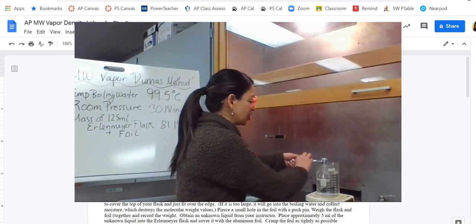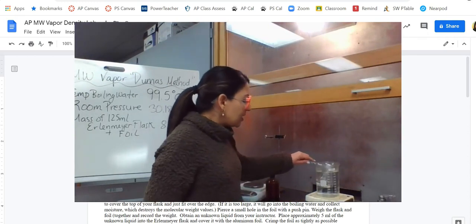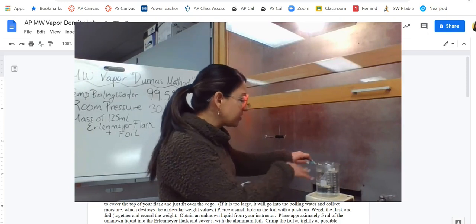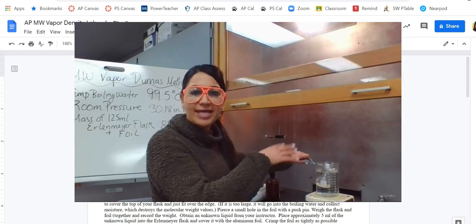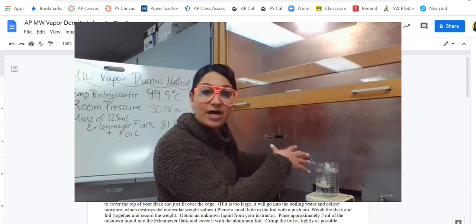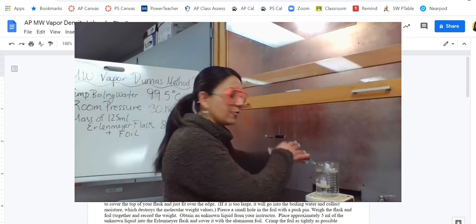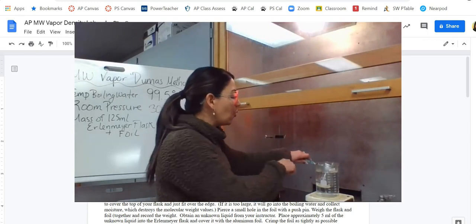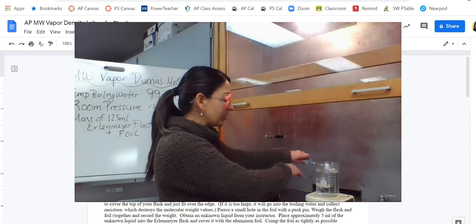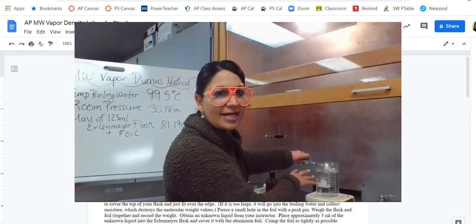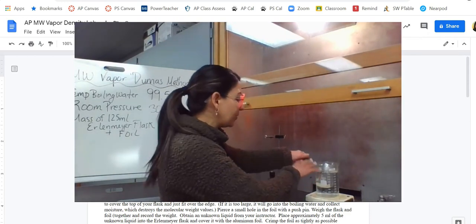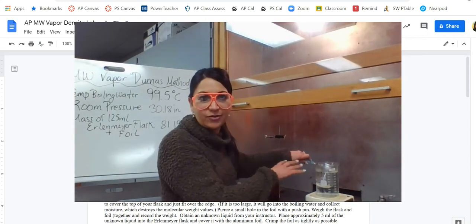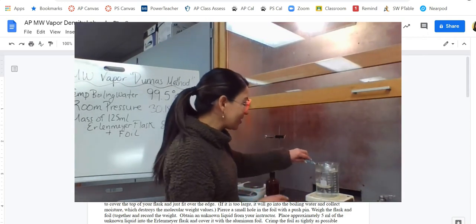So probably usually about five minutes, and then after that I'm going to wait about three minutes. So once I see that the liquid is pretty much gone. So let me just put this in here while I'm chit-chatting with you now. So the idea is that what's going to happen inside of here is it is going to start to vaporize, and we said it'll end up reaching like an equilibrium is the idea. And so it reaches an equilibrium with a pressure on the outside, surrounding pressure. So what's going to happen is it'll fill, that gas will end up filling inside of the container, and then it should be at a point where it is taking up the entire volume of the container.